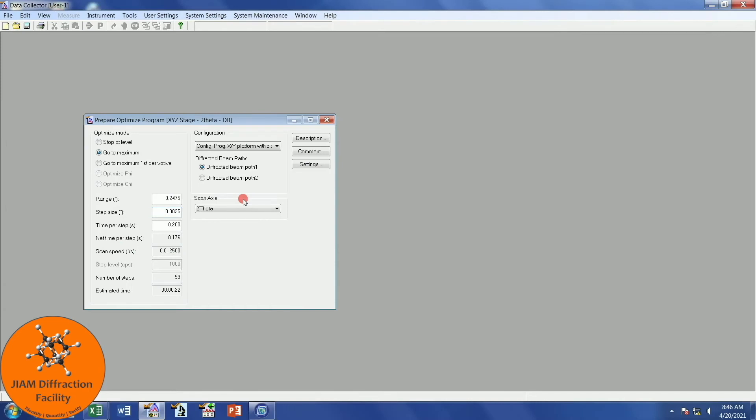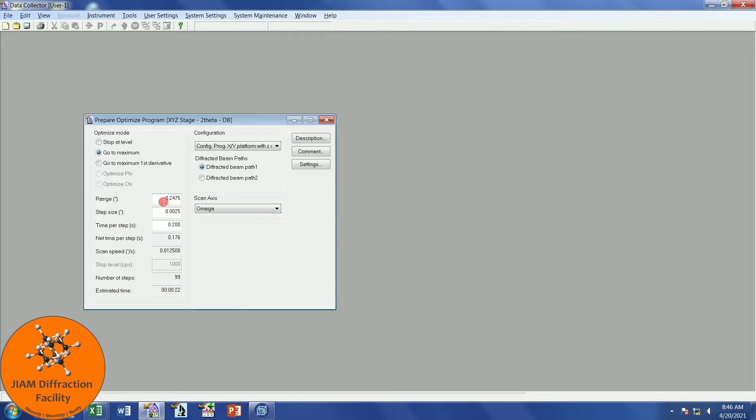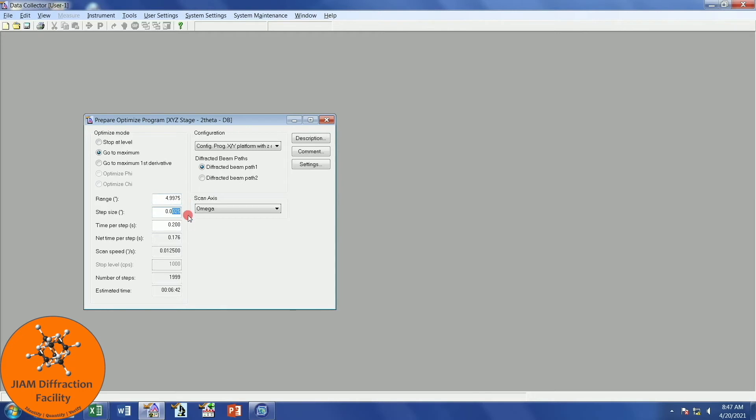The next type of scan is Omega. Typically, because we are a user facility, we have a lot of different types of samples come through the lab, which means that we have a wide variety of peak shapes for Omega. Sometimes they will be very broad and far away from 0, and sometimes they will be very sharp and may be close to 0. In order to ensure that I capture at least some sort of peak, I set the range to be 5 degrees, which would make the step size 0.05. And the time per step stays the same.